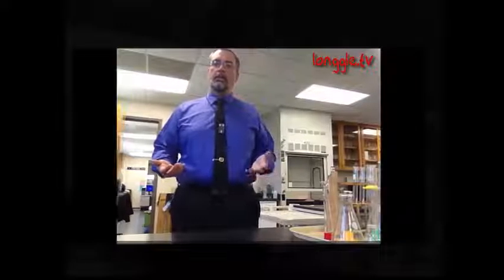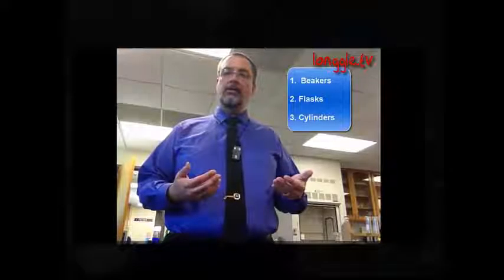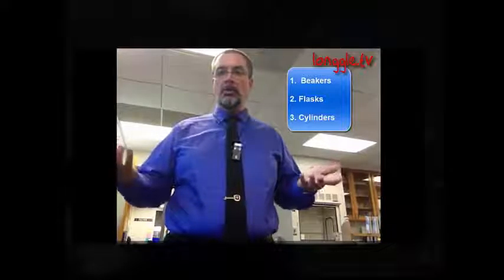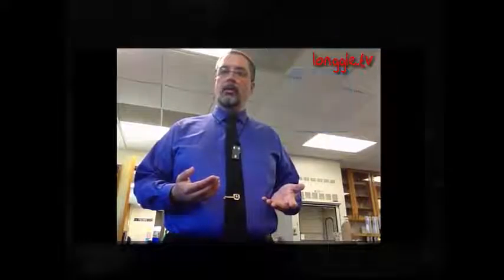I will tell you, some of the glassware is a little confusing at first until you're used to the terminology. So hopefully we'll get you used to the terminology pretty quick. We're going to start with some basic glassware. Now there are three general types of glassware that you're going to be coming in contact with: beakers, flasks, and cylinders. It's pretty simple actually. The way you tell the difference between them will also help you understand how they're used.